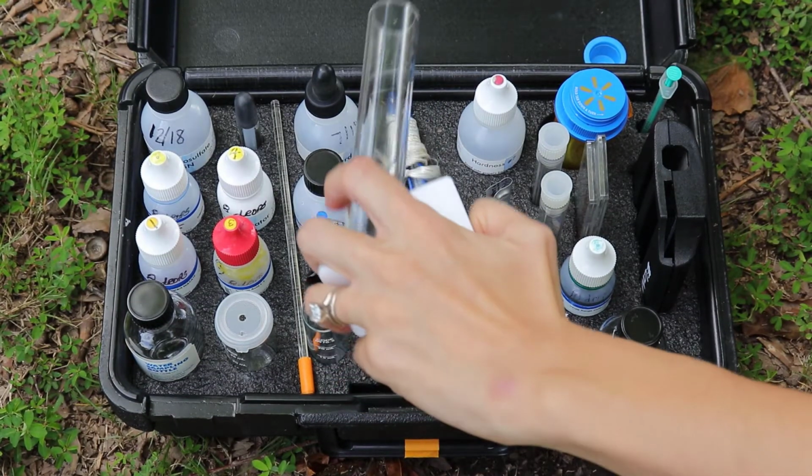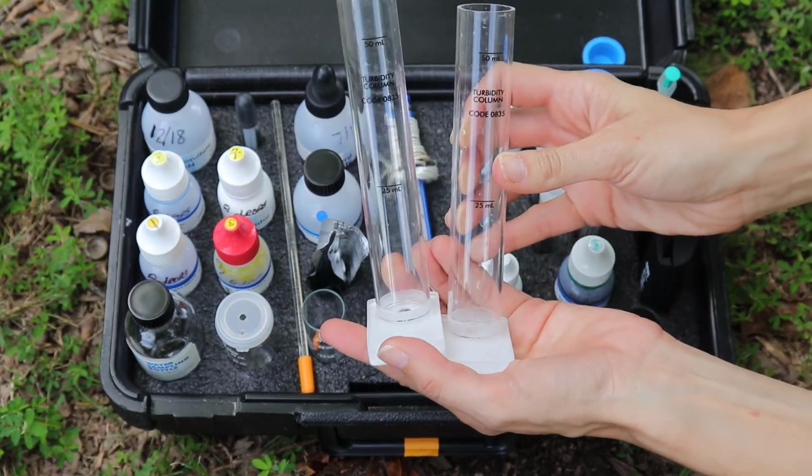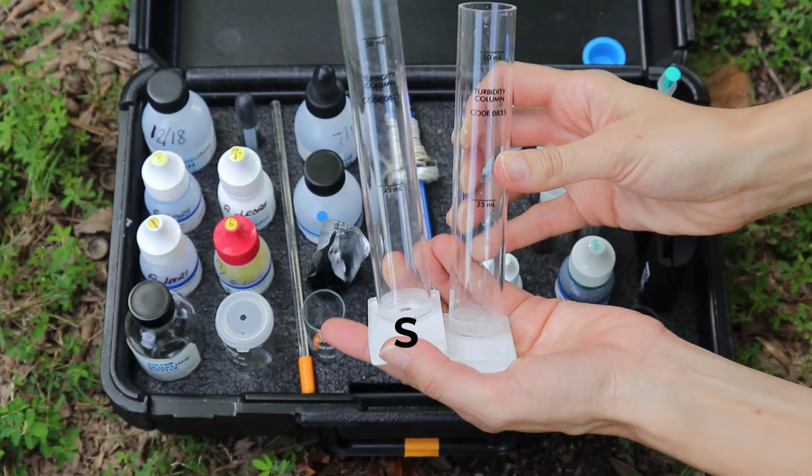Locate the turbidity columns in your kit. If you are using your own kit, we recommend labeling one of the turbidity columns with an S for sample and the other with a C for control or a T for tap water.